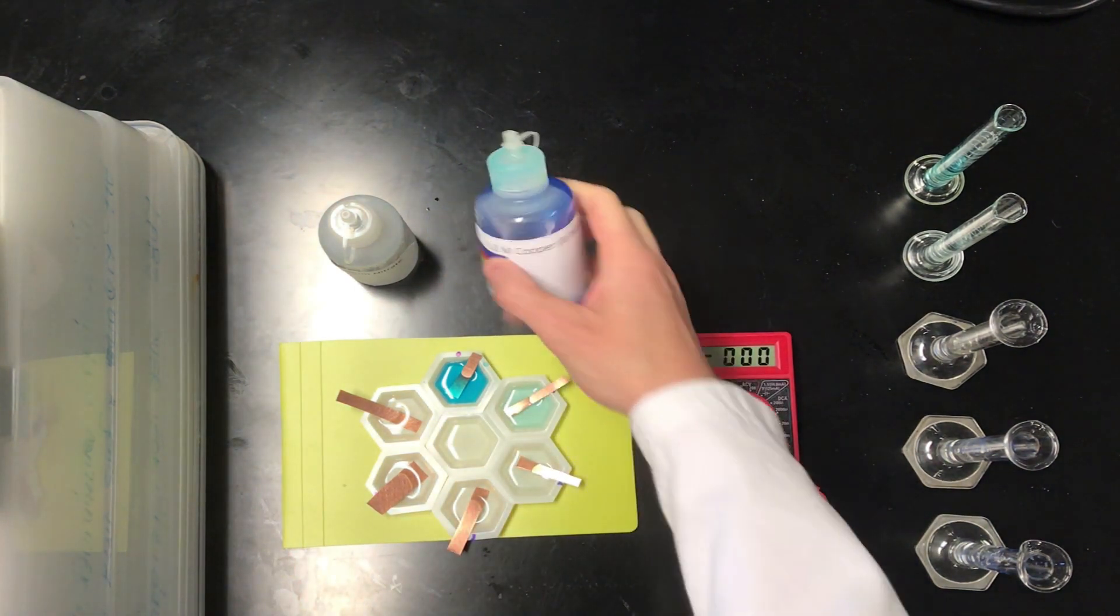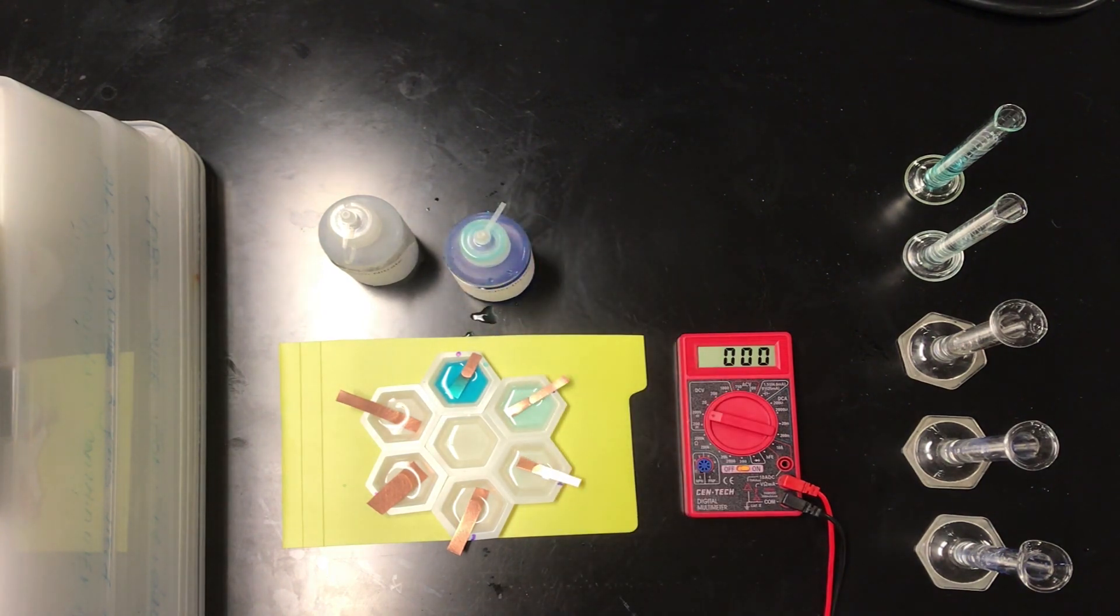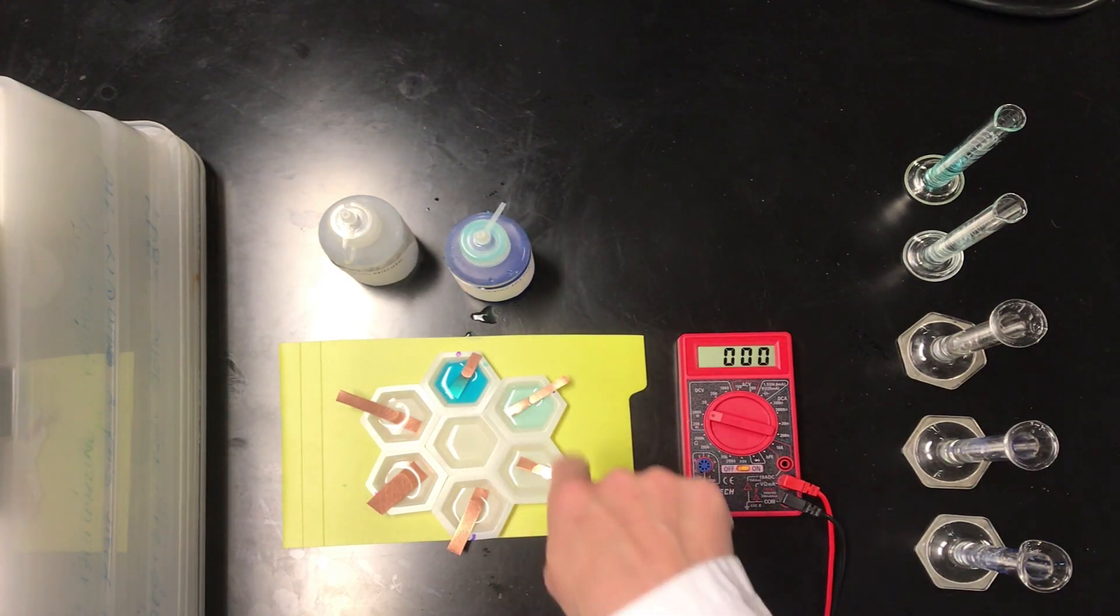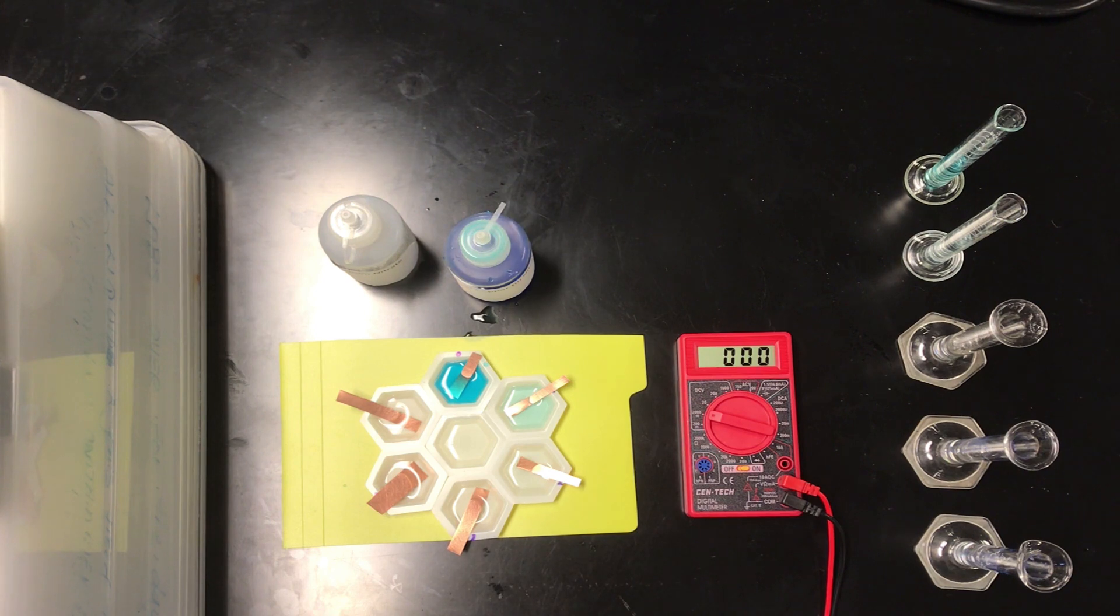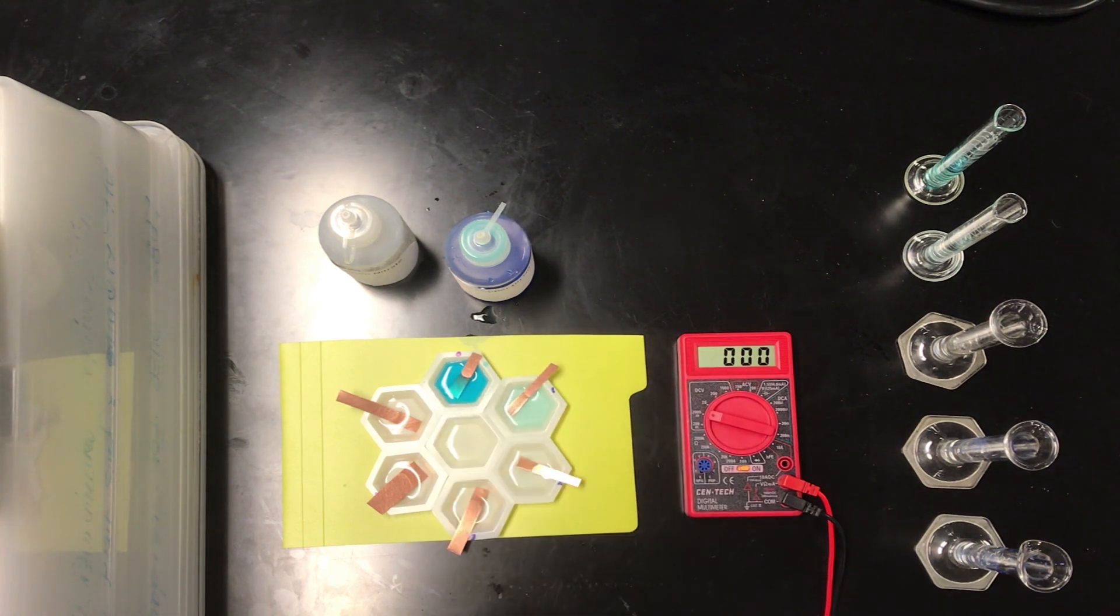The dark blue solution that you see is a 1.0 mole per liter solution of copper to nitrate, and each of the other solutions also contain copper to nitrate in different concentrations. So that first one is 1.0 or 10 to the 0 moles per liter.